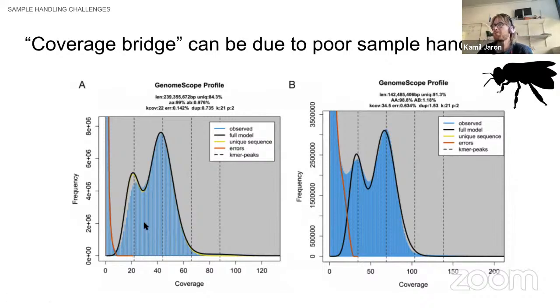And in one case, they had this okay-looking k-mer spectra. They fitted the right genome size of a honeybee, which is approximately 230 megabases. The k-mer coverage was 22x, and it all looks good. If you look at the right one, surprisingly the coverage is actually higher, right? So given this coverage, you would imagine that it would be super well separated from the errors, but it's absolutely not. And what's more, if you fit that model, you're missing about 100 megabases of sequence.